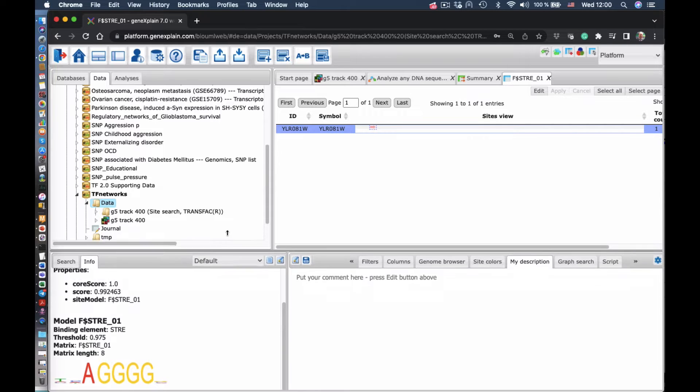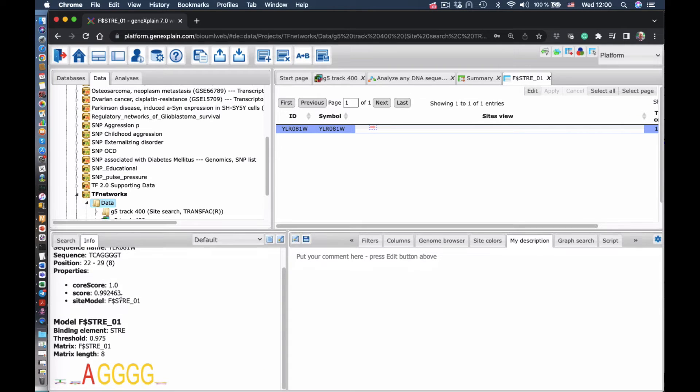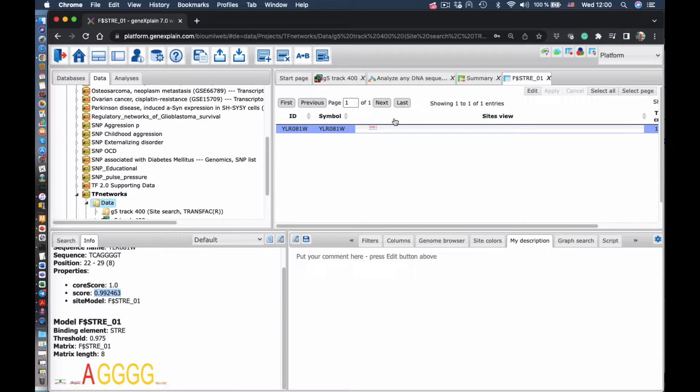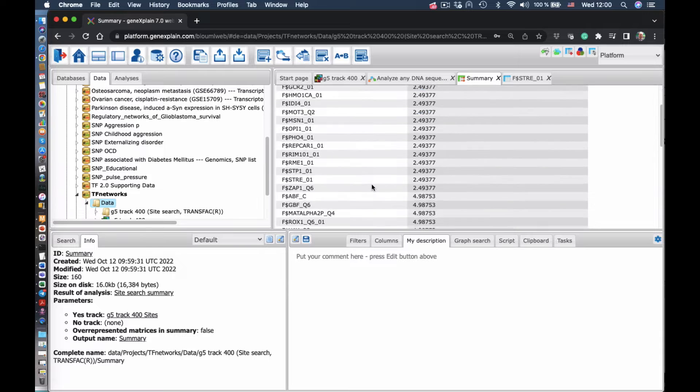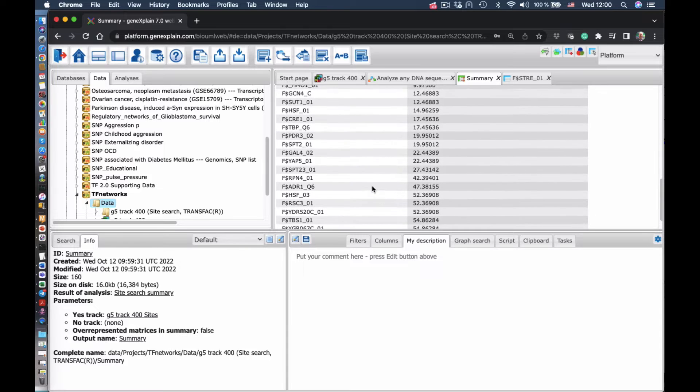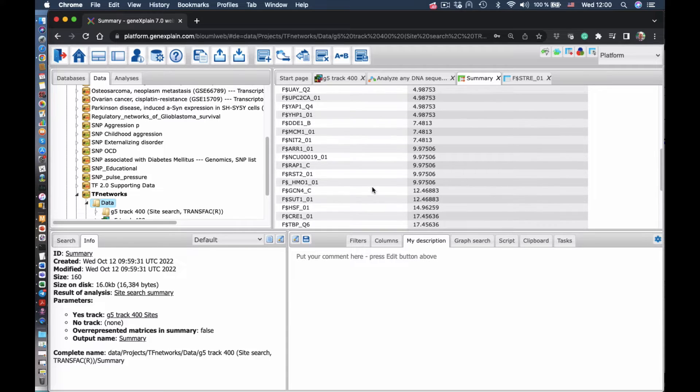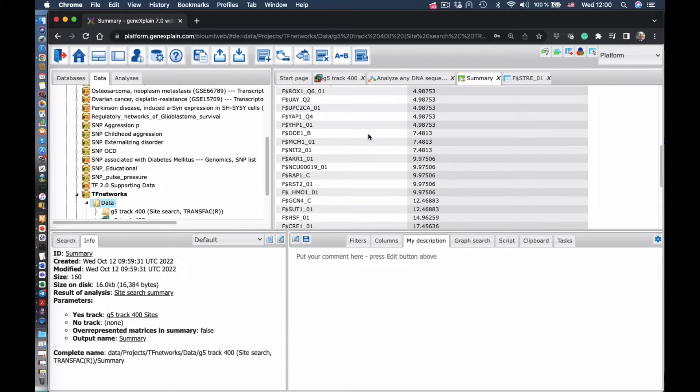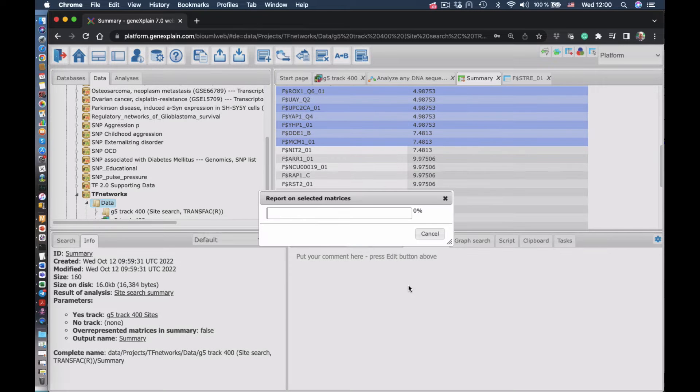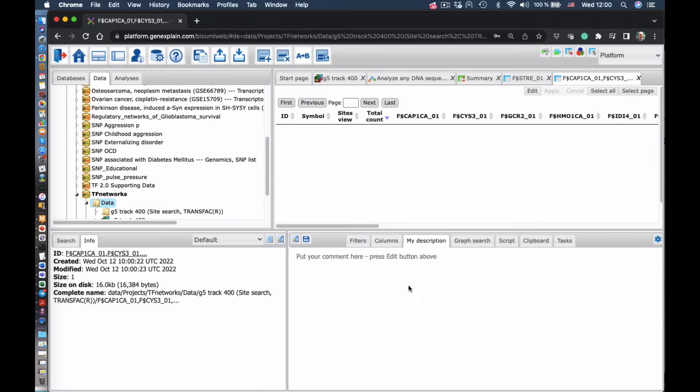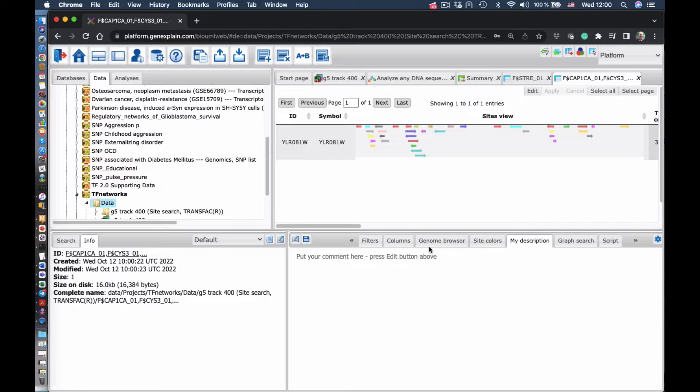We see the consensus of that site, the core score, the score of the site. And then we can go basically to a whole list of those found sites, select, say, top of them, and visualize all of those sites together.